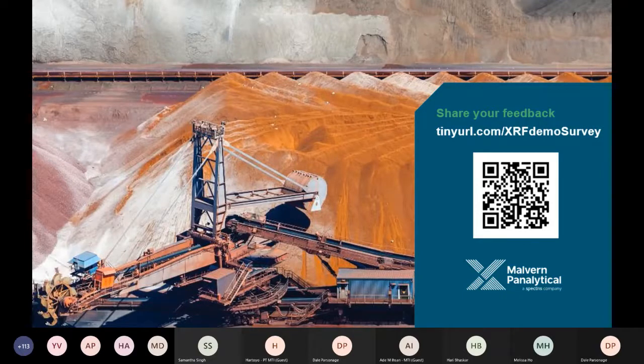It runs on normal power. The only additional service is the helium if it's there, but even for my laboratory, mine sits on a small trolley, so that when I want to move it or take it to demonstrations, I can move my whole setup very quickly. It also warms up and stabilizes very quickly as well. So within moving it and having the instrument switched on, you can probably be analysing a sample within the first hour or so in a new location.